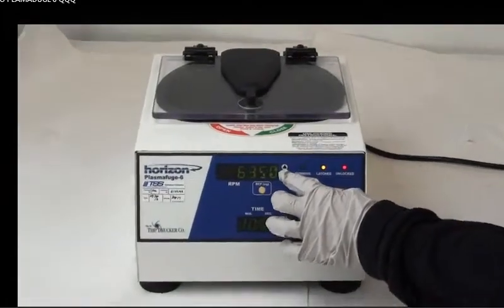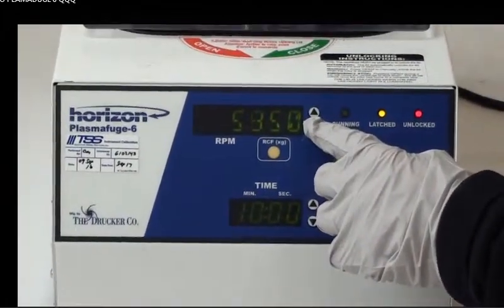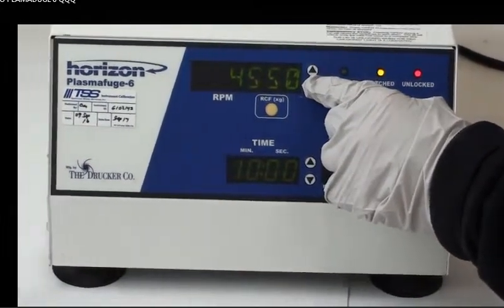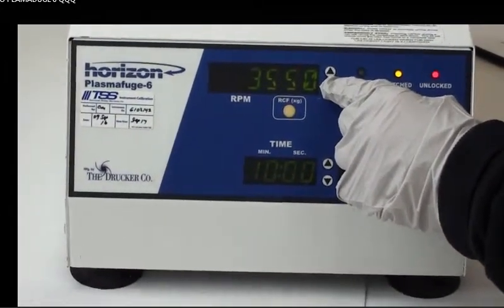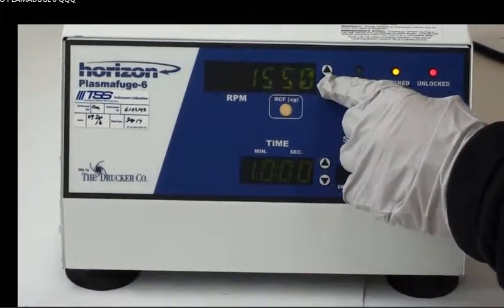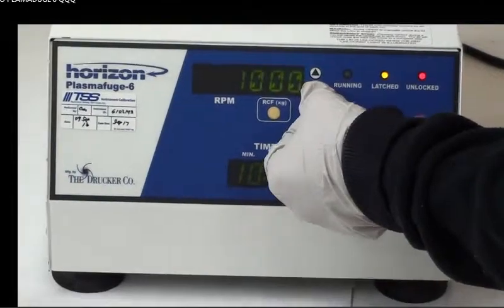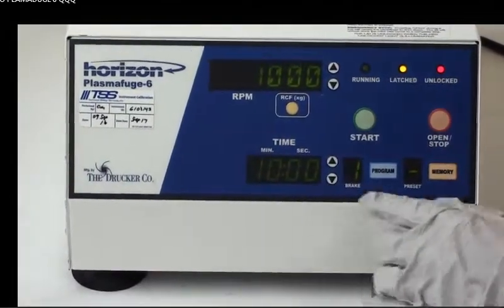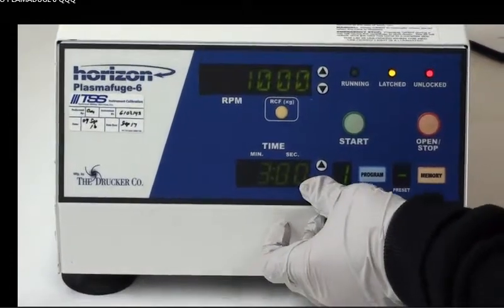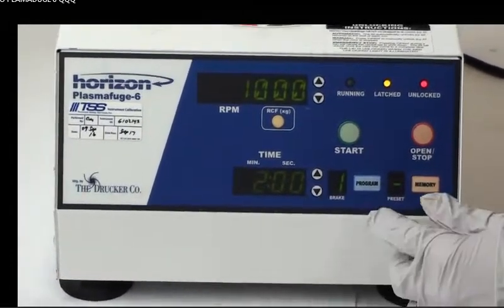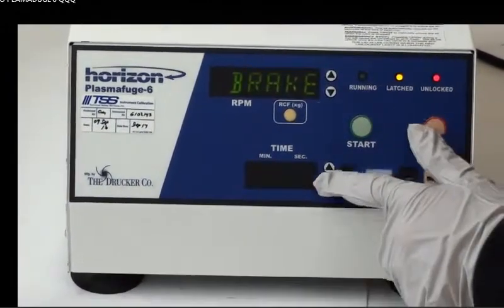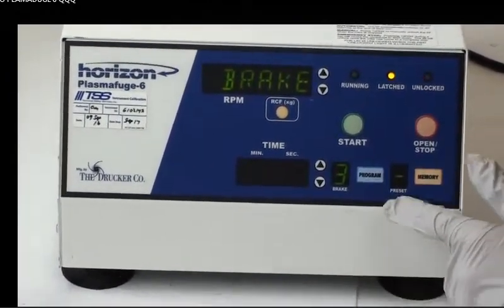Let's say we wanted to go down to a thousand RPM. All you need to do is press this down arrow next to the RPM bar, so we're at a thousand. We can also adjust the time. I'll change it to two minutes exactly, and then if you go into program you can change the brake. You can make it go higher or lower.